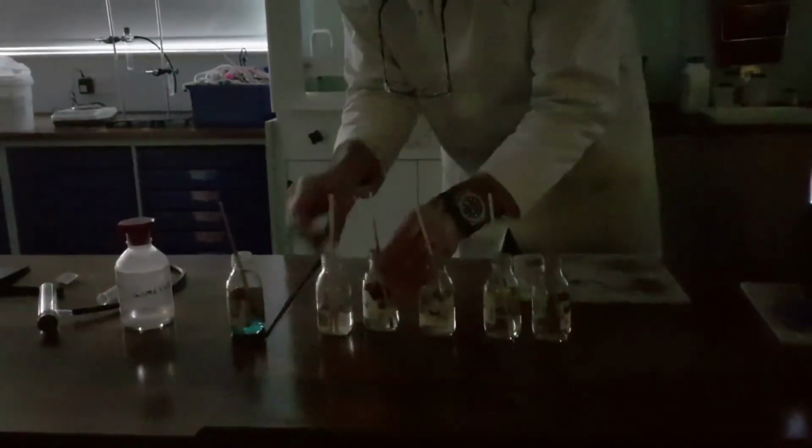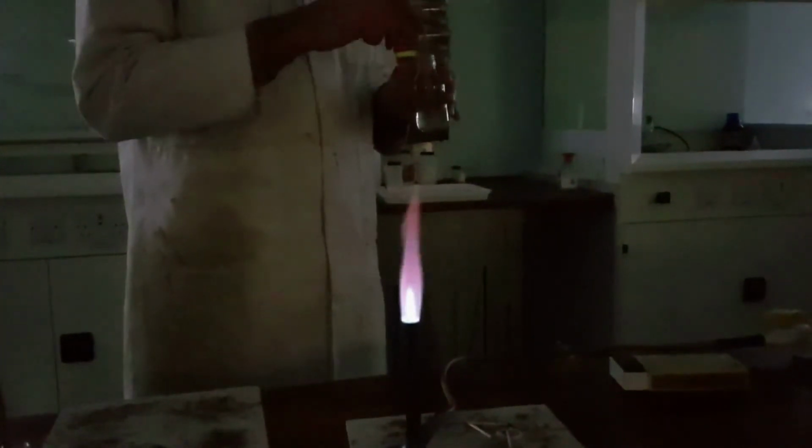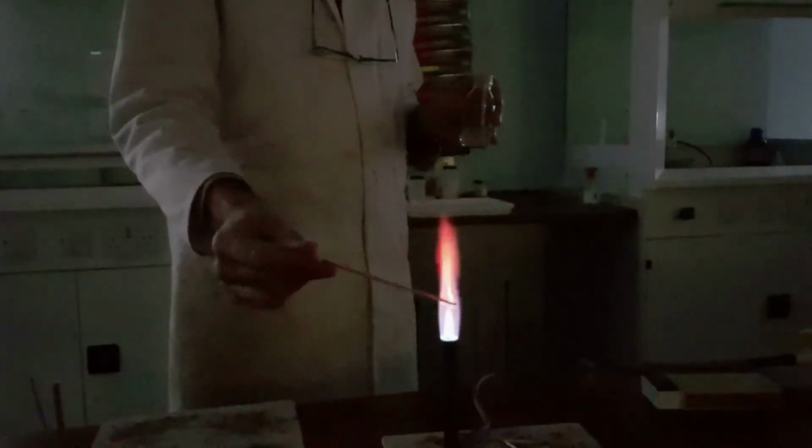The final one you need to know, there's two more. This one you don't need to know, but this is quite nice. This is strontium. So strontium giving another red flame, a slightly deeper red than the lithium, often described as a scarlet flame when compared to the crimson of lithium. Strontium often used in red fireworks.